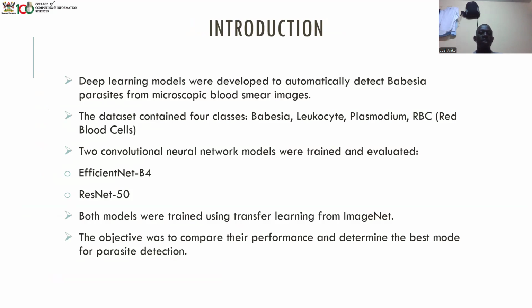I trained two deep learning models that detect Babesia parasites from microscopic blood smears. The dataset contained four classes: Babesia, Plasmodium, red blood cells, and leukocytes.